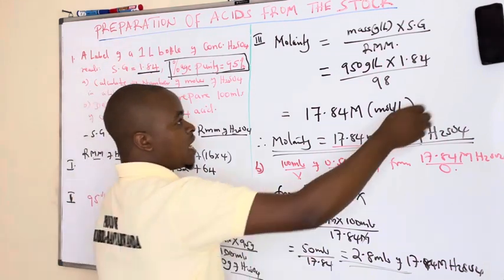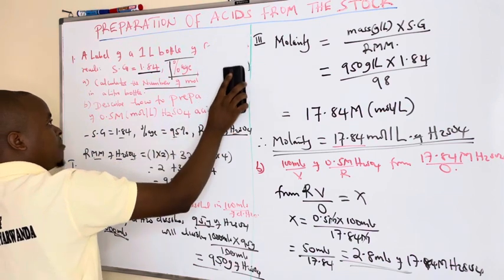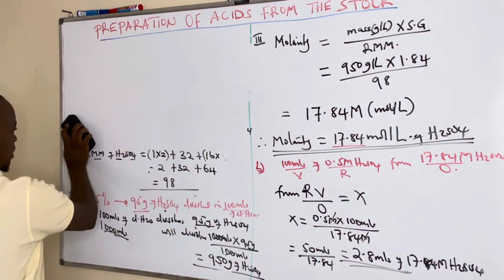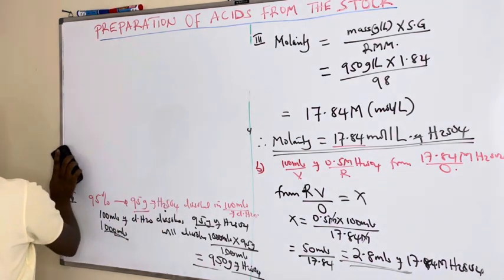So we shall end by describing the procedure. Before we get the requirements, remember the rule: you add acid to water.